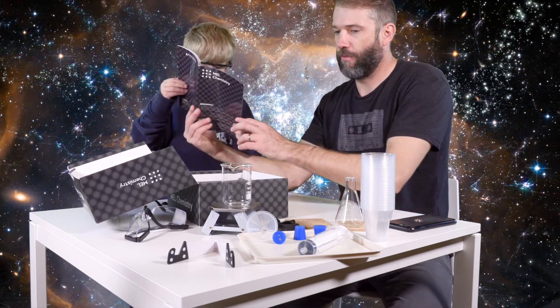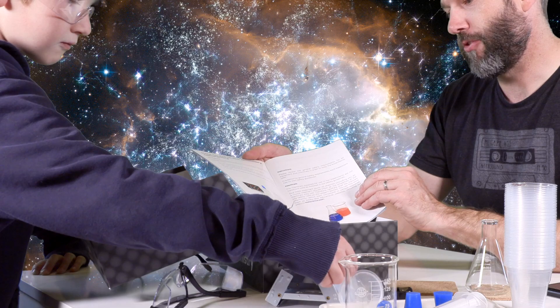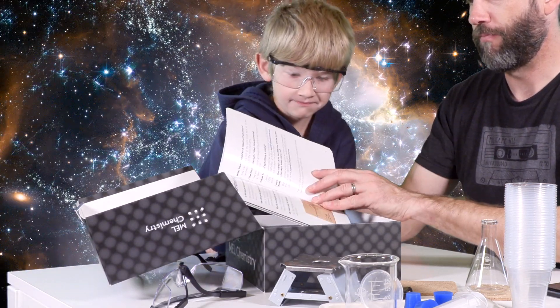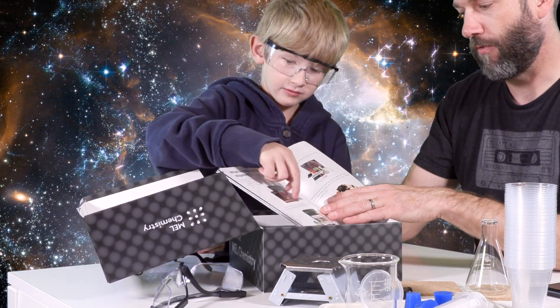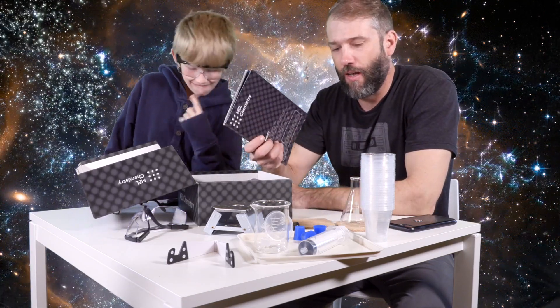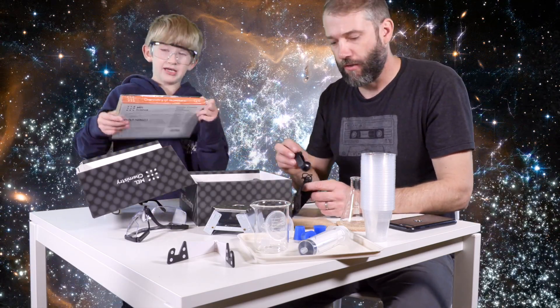So, what's in the book? Let's put it down right here so we can see it. Inside the book we have how to act in the chemistry laboratory — oh, this is good stuff. Safety requirements, never lick the spoons, first aid, information for parents, battery cells. This is basic safety stuff, as well as some information on the M.E.L. Science product itself. I actually worked in a laboratory — I was a laboratory tech for ten years, so all this stuff is very familiar to me. All of the chemistry protocol is familiar to me. We're not going to read the directions.